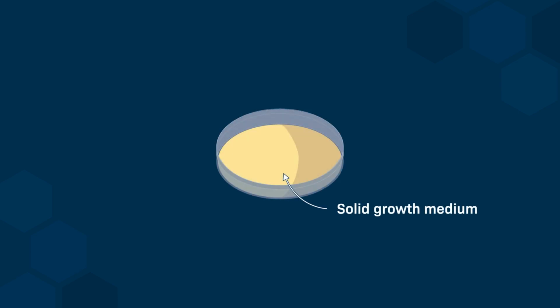Bacteriophages can be used to infect a plate of bacteria that grow on a solid, nutrient-rich medium. Growing bacteria completely cover the surface of the plate and form a milky opaque layer at the surface, called a lawn of bacteria. A small volume of the bacterial culture is mixed with a known volume of a bacteriophage solution. The mixture is added to a solution of top agar maintained at 42 degrees Celsius. Top agar is a low concentration of agarose in solution in a nutrient broth. At 42 degrees Celsius, the solution containing bacteria and bacteriophages in top agar is liquid.